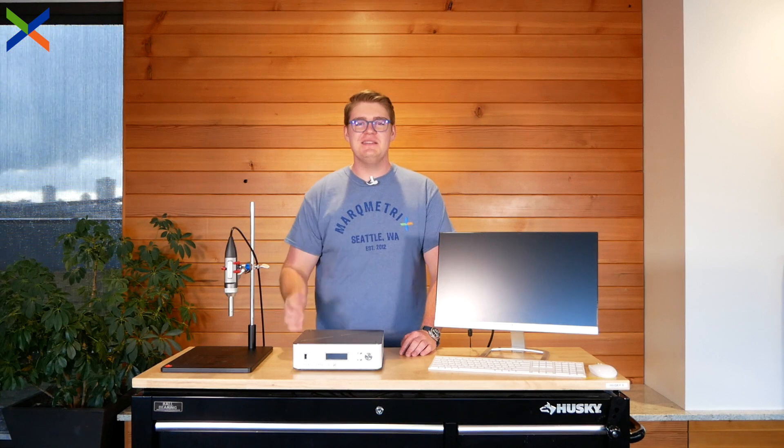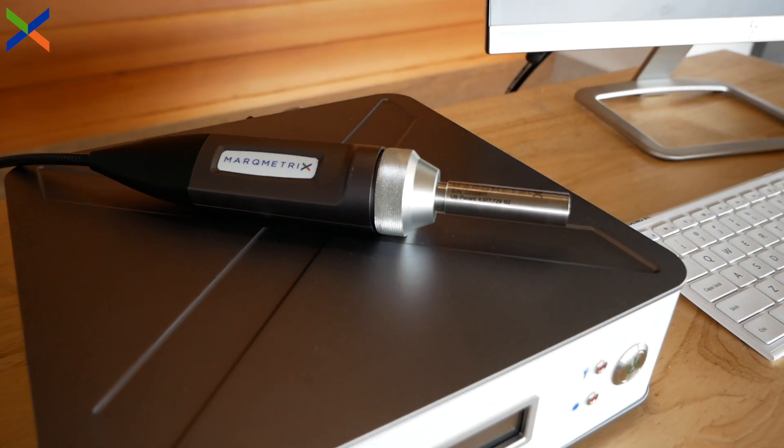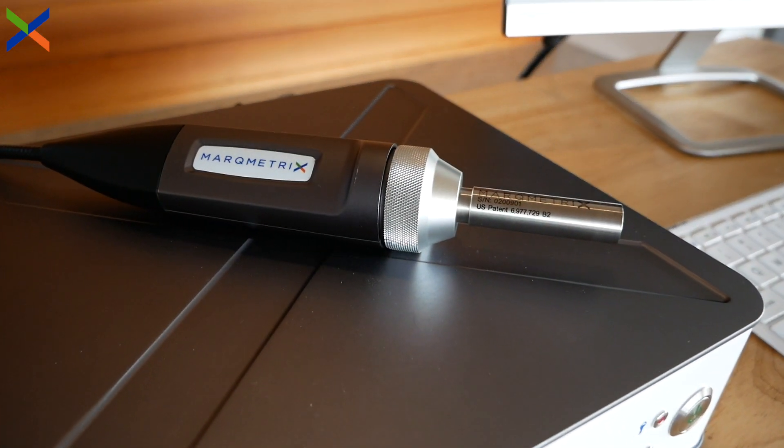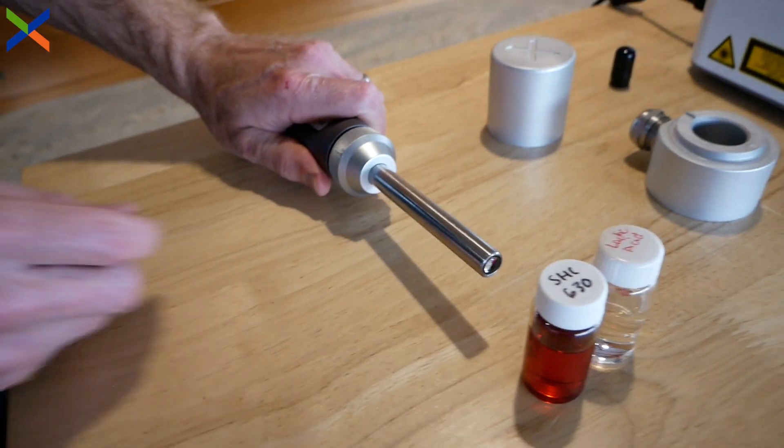Hi, I'm Mike with MarqMetrix, and today I'm here to introduce the latest addition to our lineup of probes and sampling interfaces. This is the Proximal Ball Probe line. This video will cover the specs for these probes and walk you through some applications that take advantage of Raman sampling from a distance.